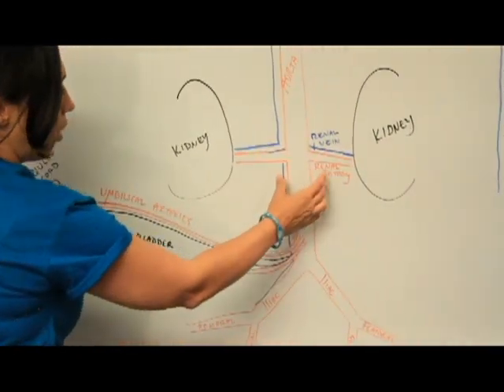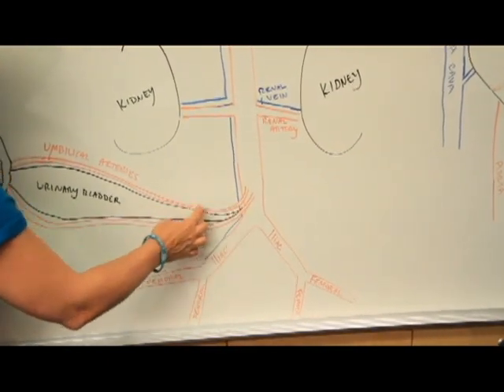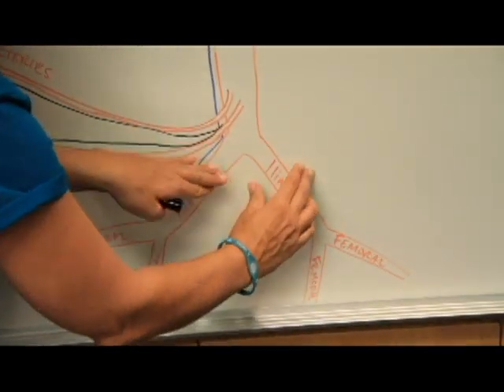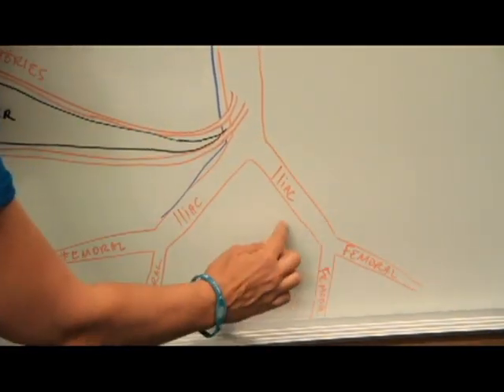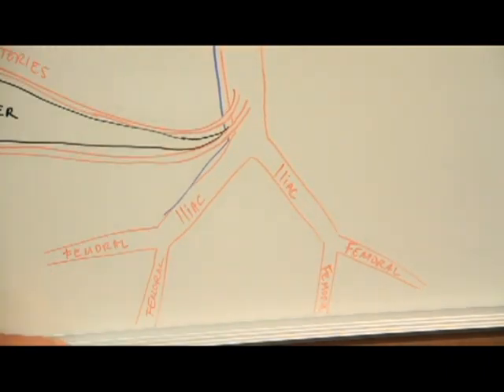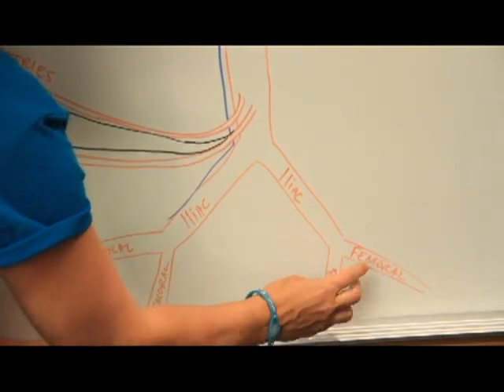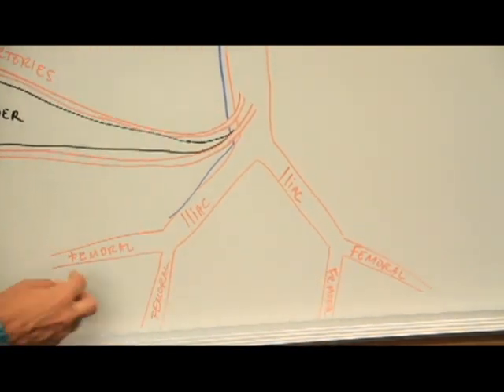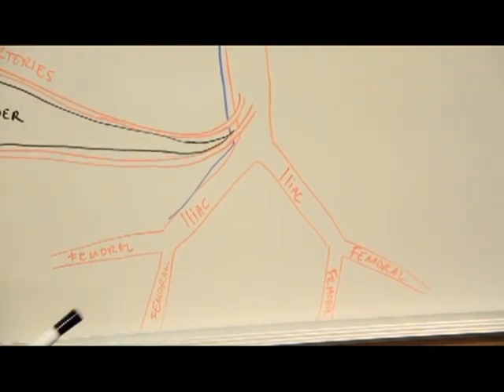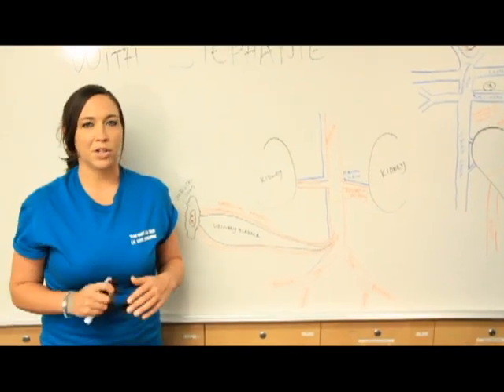Now as we follow this all the way down, basically right where this umbilical cord and the umbilical arteries kind of branch off, you're going to have this split of the aorta. And it's going to split to two sides. Each one of those sides are going to be your iliac. So the first split off the aorta, kind of down towards near the legs, really like the hip area, that's going to be your iliac. And then when it splits again on both sides, it turns from your iliac into your femoral on both sides. So iliac first, and then femoral, femoral. And that basically sums up the circulatory system.